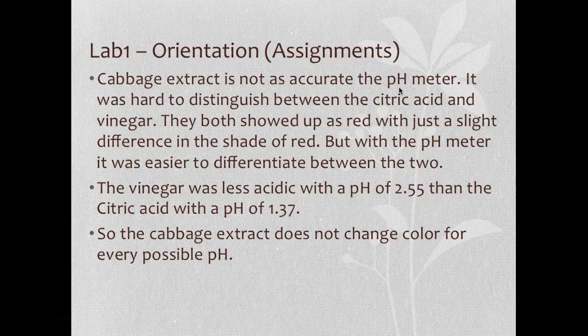If you have finite numbers, it's then easier to make that distinguishing feature between the acid which was less acidic as compared with the acid that was a stronger acid. So cabbage extract is not changing color for every possible pH, but some of the pH.